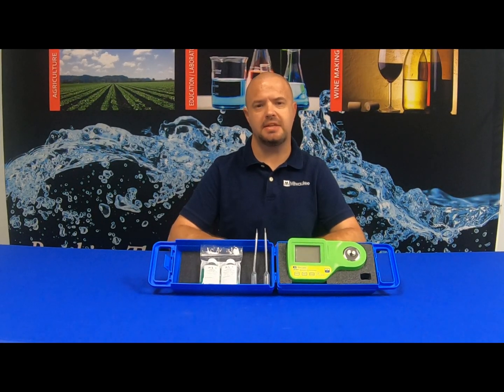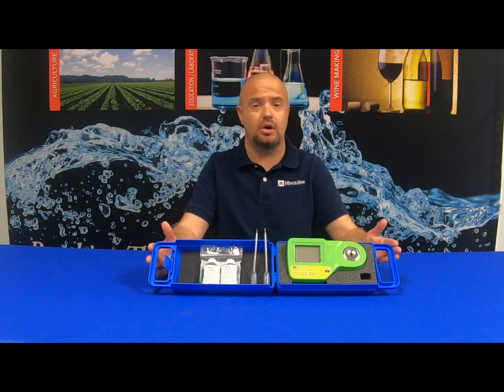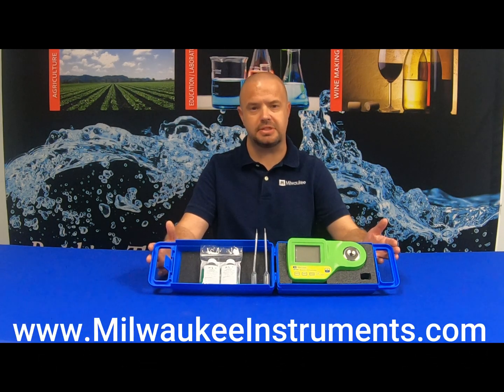For additional pipettes and validation kits, or to purchase your MA-887 and MA-800 hard carrying case, simply visit milwaukeeinstruments.com.